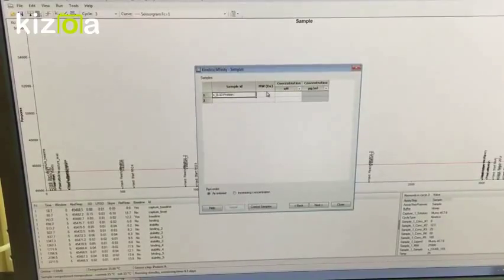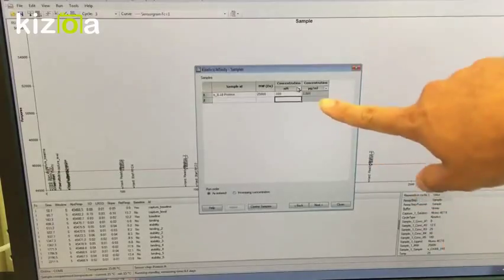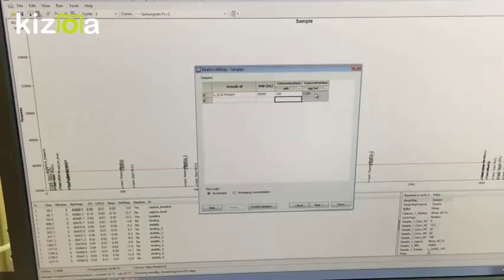In here, let's say we know the molecular weight of the protein is 25,000 Daltons, or 25 kDa. Now normally I want the nanomolar concentration to start at 100, and you do 1 to 2 dilutions. Once you put in the nanomolar concentration, the system automatically gives you the concentration in micrograms per mil to be able to do the dilutions. And from there you can do as many dilutions as you want.